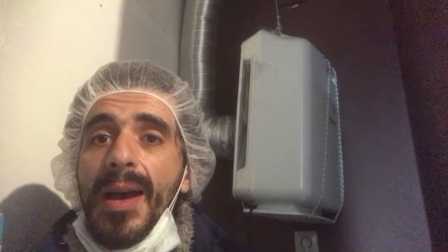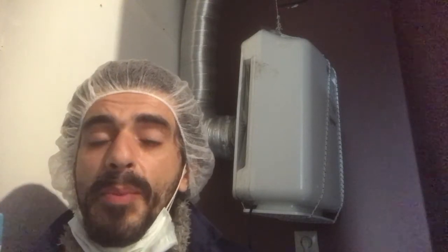Hi, I will show you today how to make a positive pressure lab using a simple HEPA air cleaner like the one I have behind me.